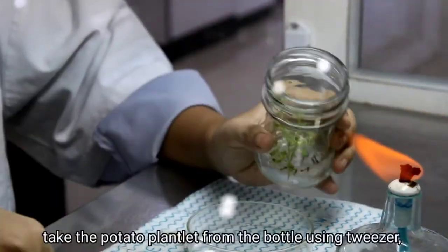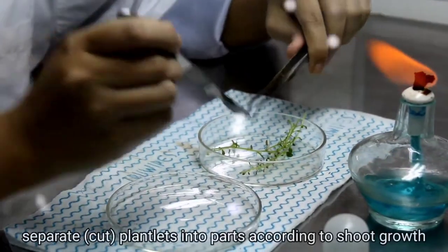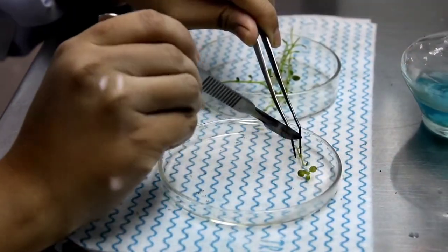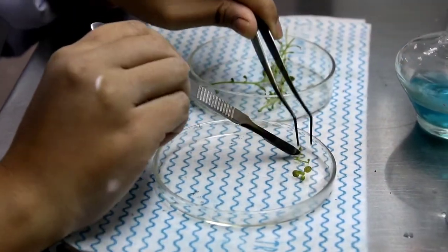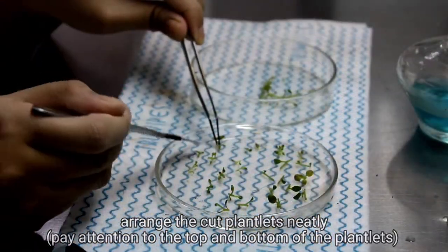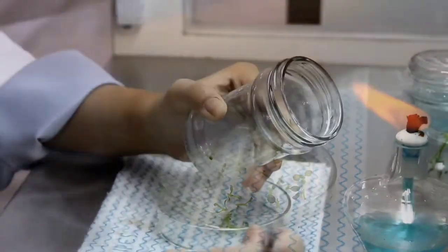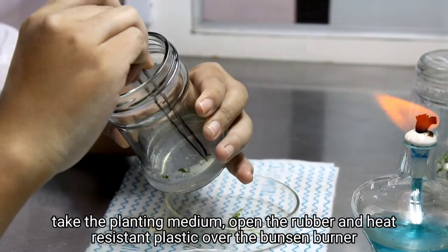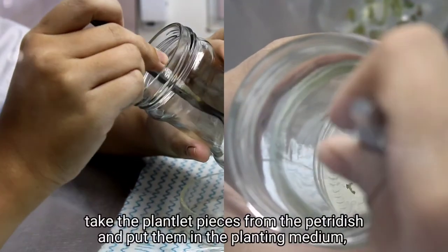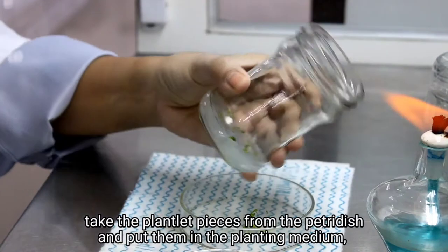Take the potato plant lid from the bottle using tweezer and put it in the petri dish. Separate plant lids into parts according to shoot growth. Arrange the cut plant lids neatly, paying attention to the top and bottom of the plant lids. Take the planting medium, open the rubber band and heat-resistant plastic over the Bunsen burner. Take the plant pieces from the petri dish and put them in the planting medium; each media bottle contains 5 plant lids.